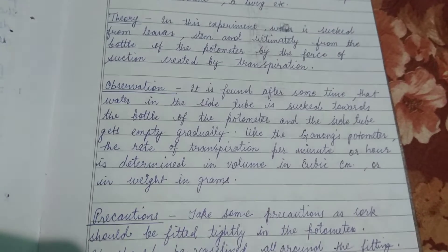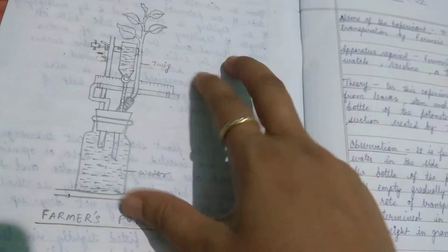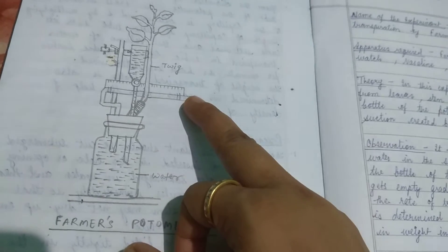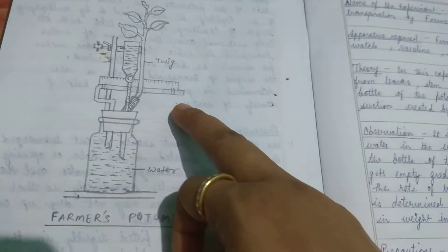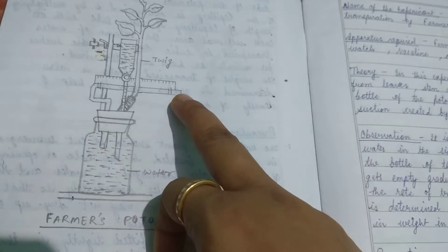The rate of transpiration per minute or hour is determined in volume in cubic centimeters or weight in grams. Here is the apparatus of the farmer's potometer. There are two side tubes and one main tube. The side tubes are filled with water, which represents the plant's water intake.